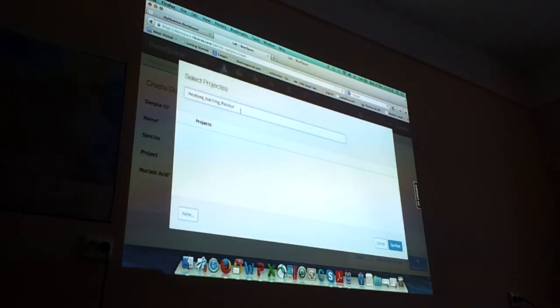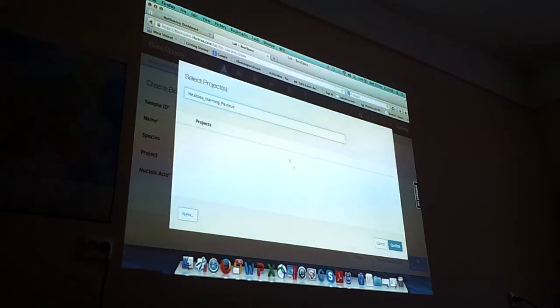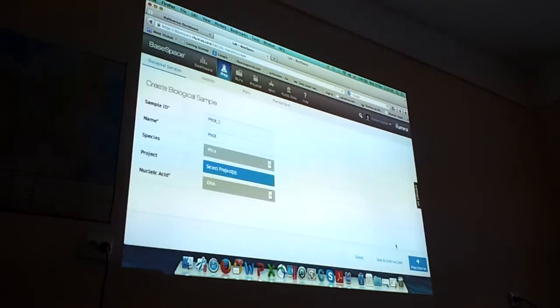Well, you can share the project then, right? Yeah, I will. Let's see. Let's try it. Okay. So you fill out all these things. Give it a name. Select a project. It's DNA.